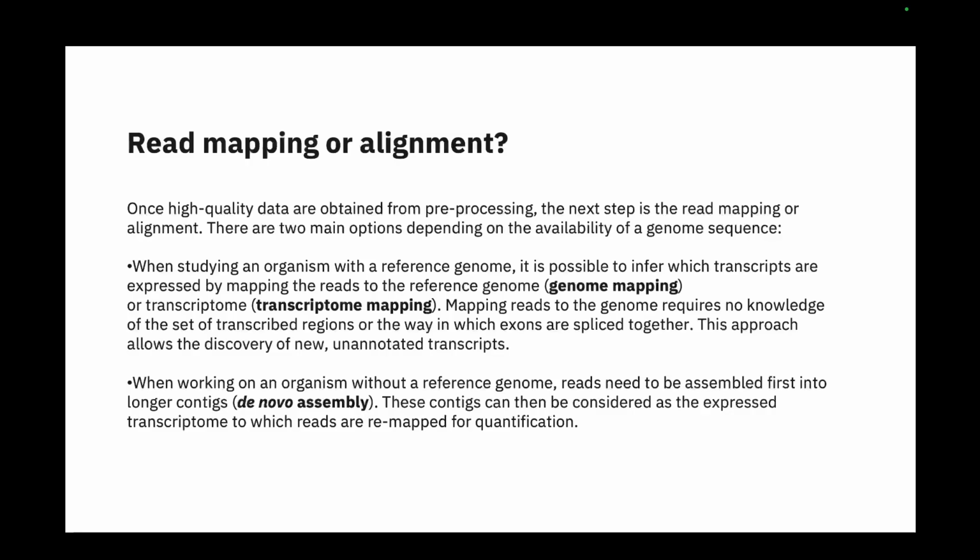So basically, you'll try to make a longer stretch of nucleotides, adding each read to another, and try to find the best possible longest sequence that you can get.